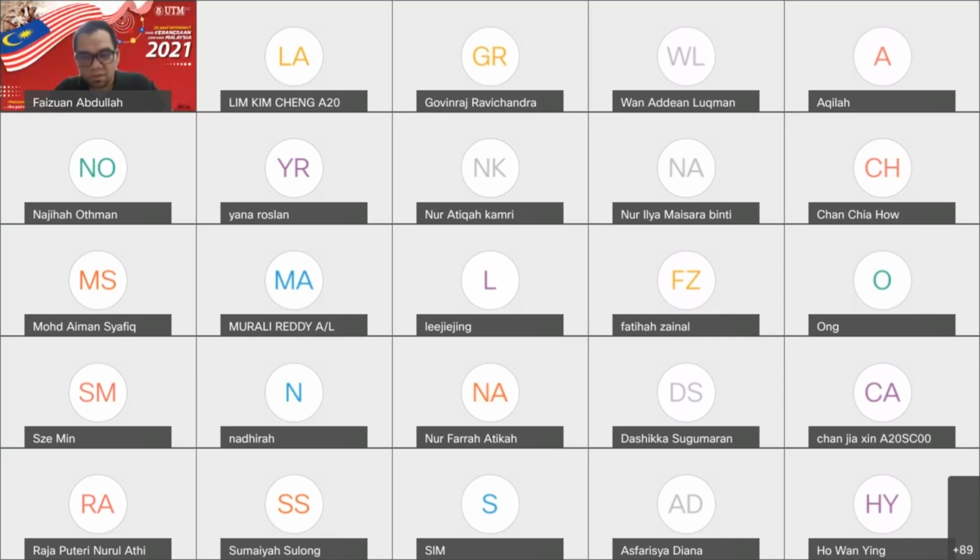Right. Any other question? Can you understand what we are doing today? The determination of zinc by using linear calibration and also standard addition methods using AAS. Can you understand what is linear calibration and what is standard addition? You can differentiate that, right? Give me thumbs up. Okay, all right, good.